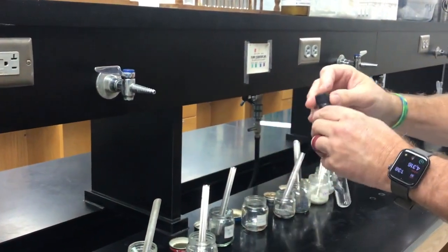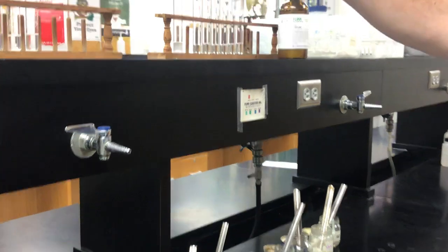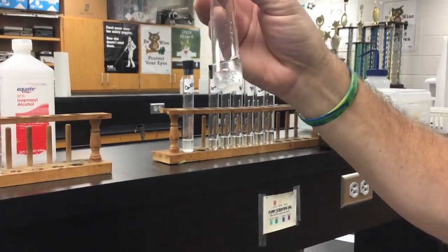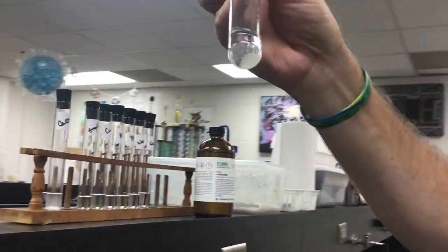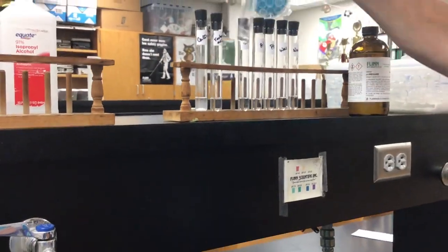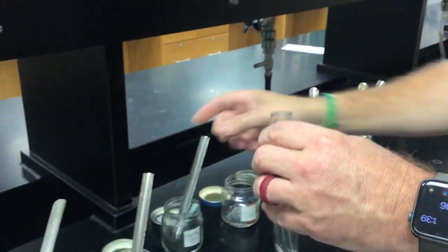Tartaric in there. We'll shake that up and see if the tartaric dissolves in there. Kind of see the solid sitting on the bottom a little bit. We'll look at it again when this is finished. All right. Graphite. We'll try graphite in here.